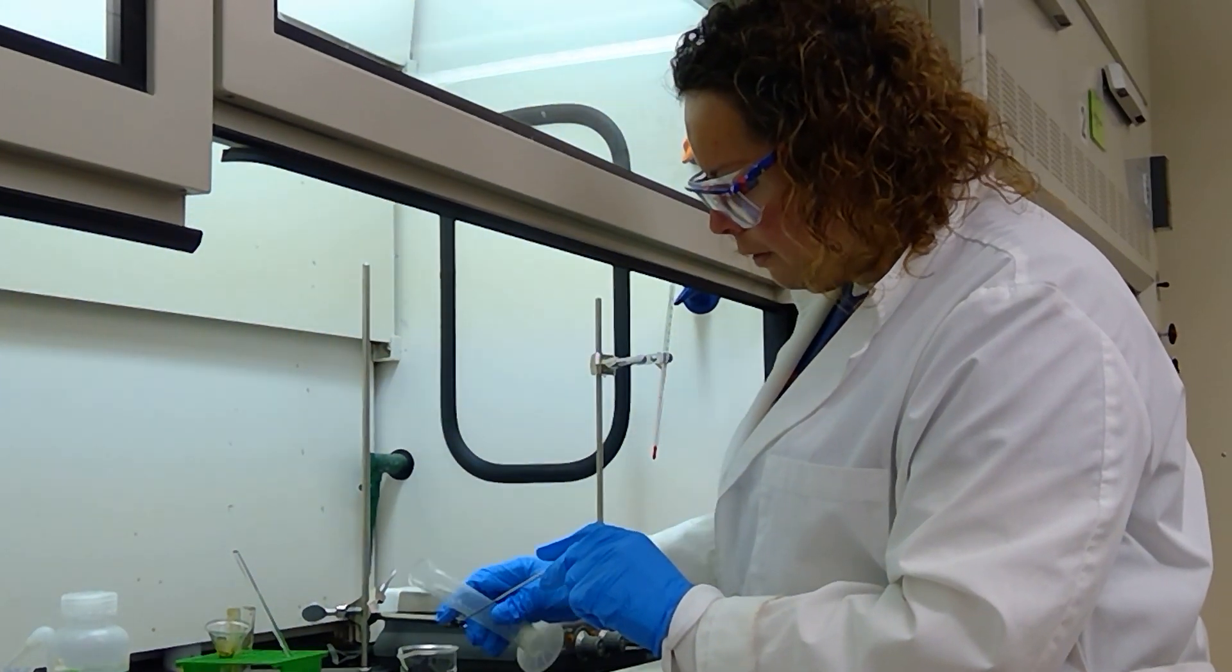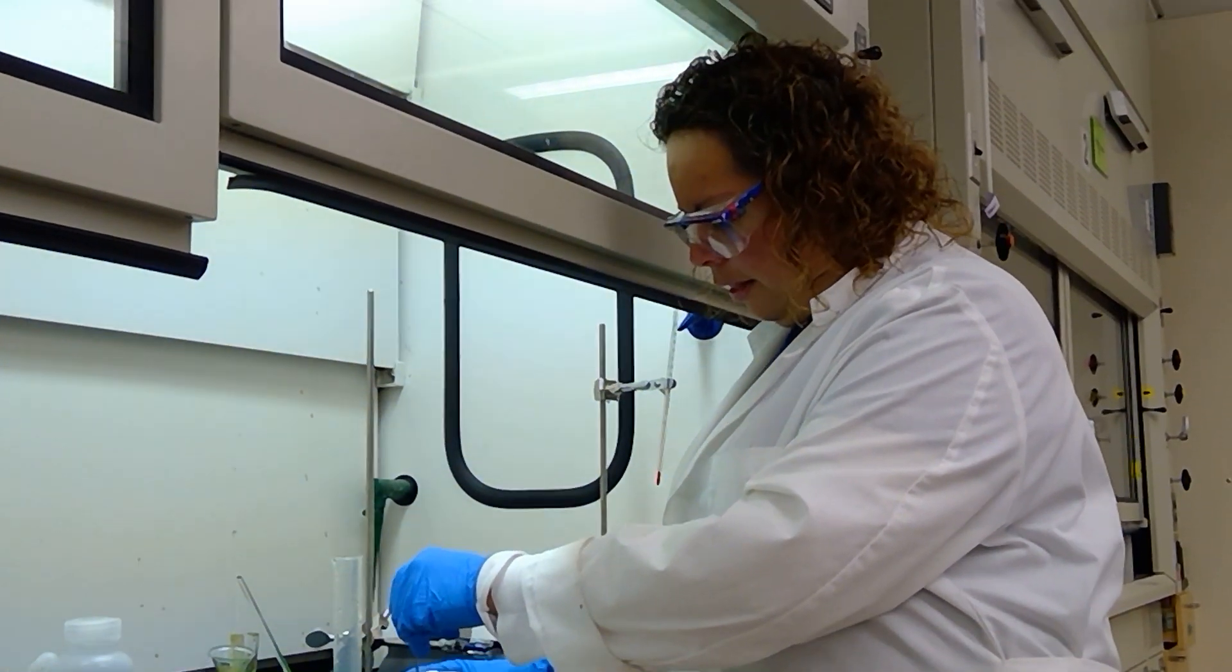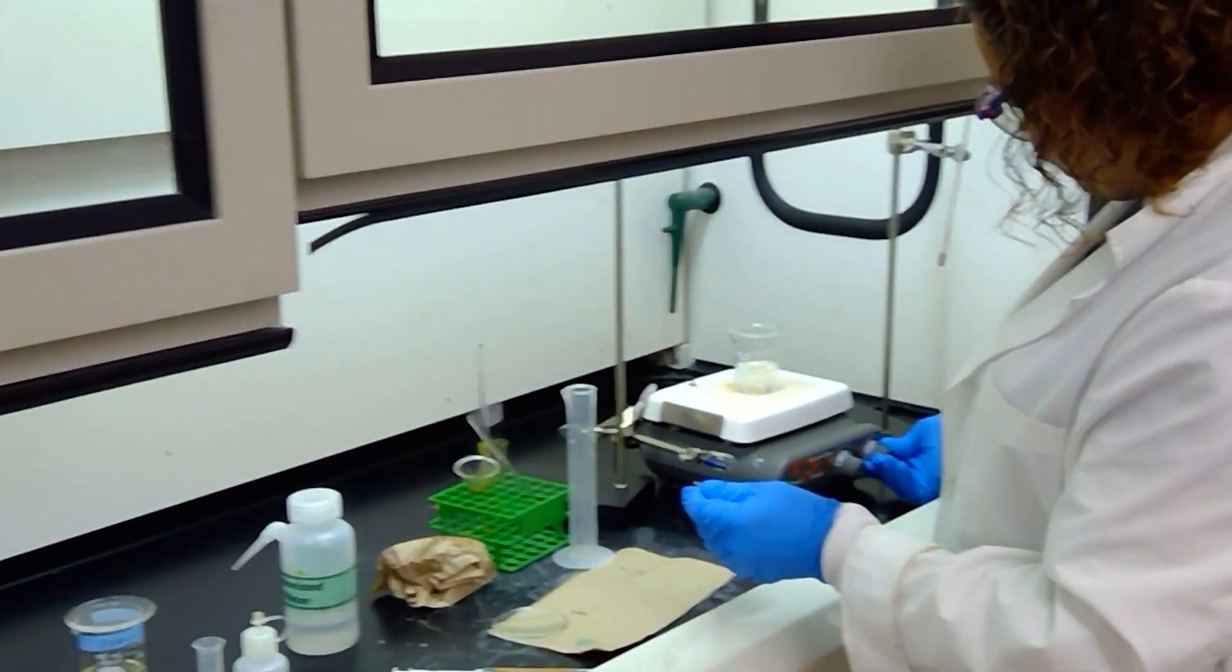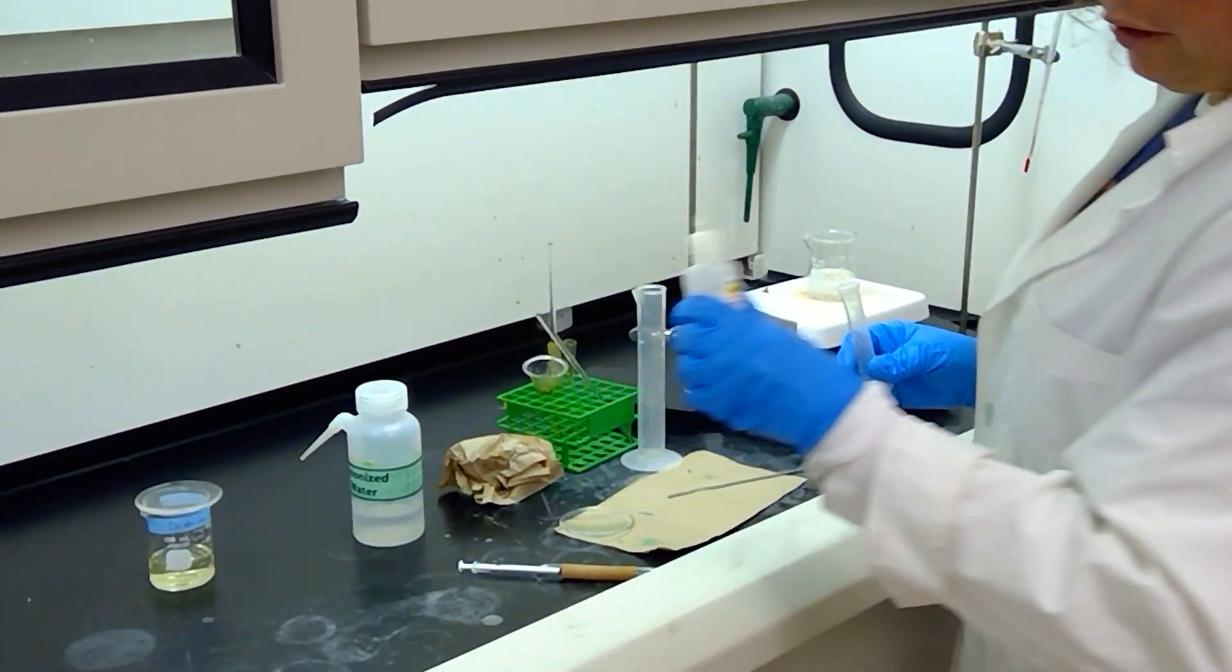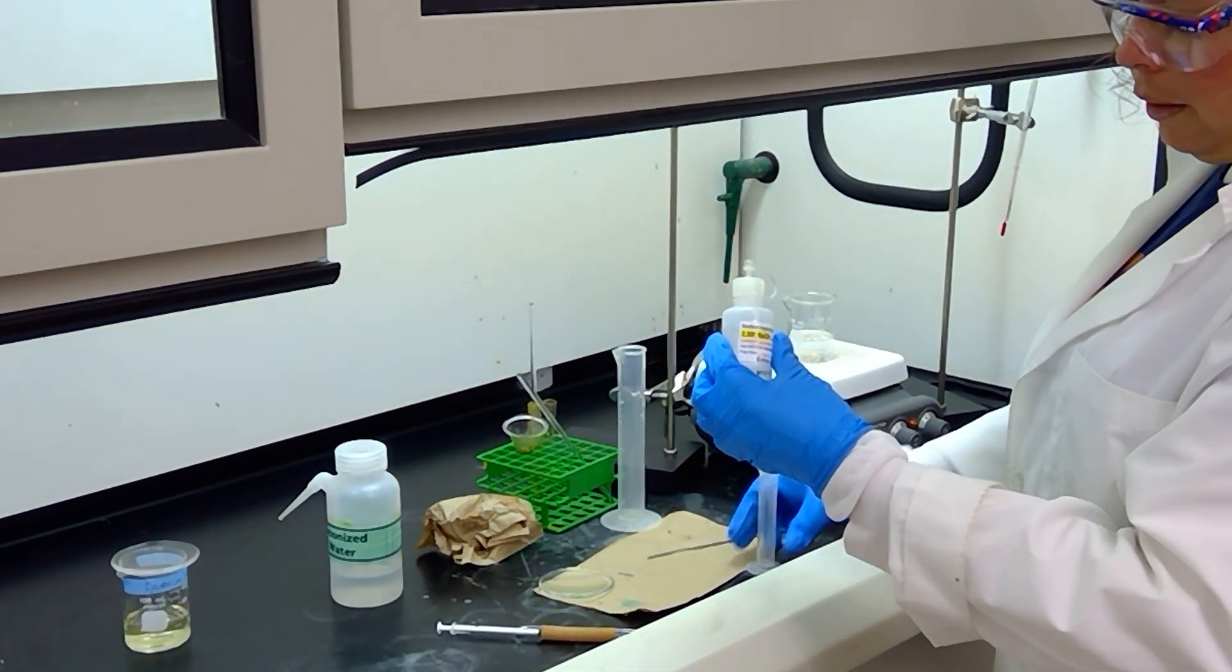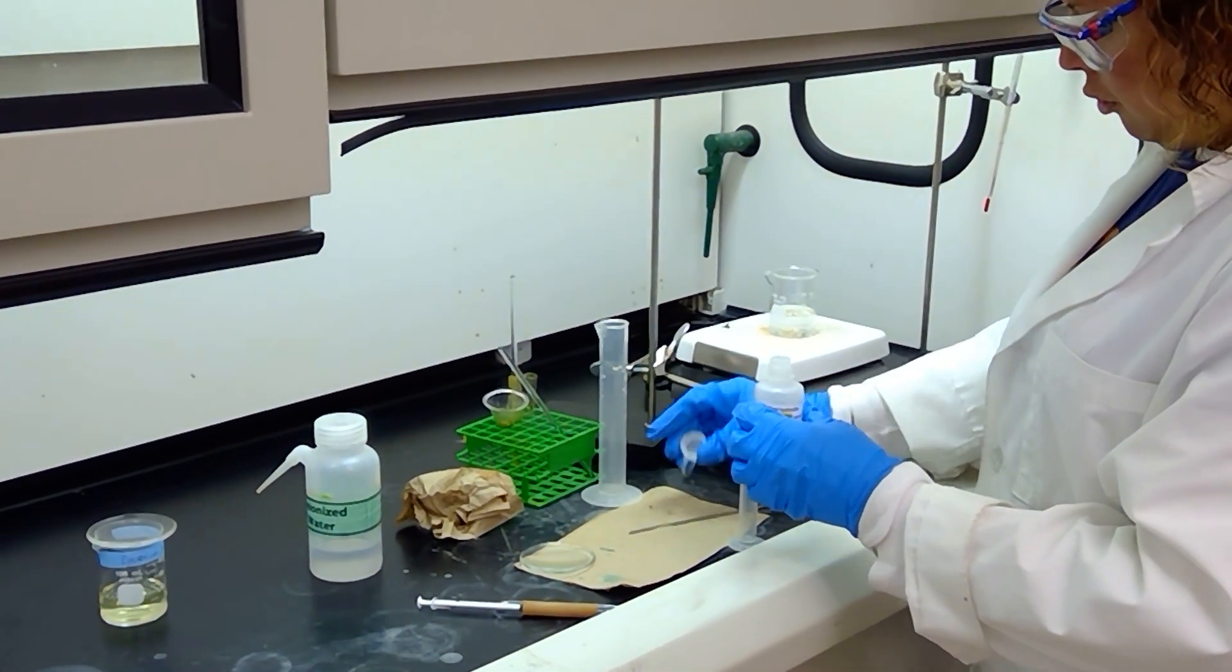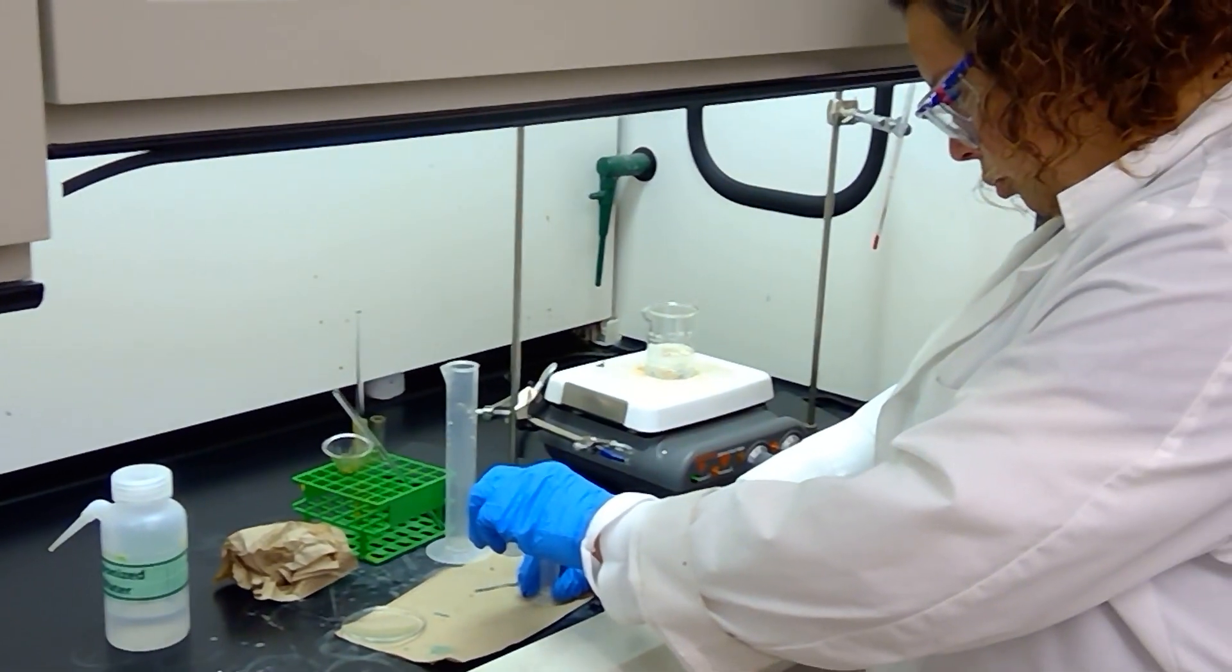We're going to warm the solution in order to help it dissolve better. And then besides water, we're also going to add some sodium hydroxide to the solution. So I'm going to add 5 milliliters of a 2.5 molar solution of sodium hydroxide to my solution, and that should help the 2-naphthol dissolve even more.